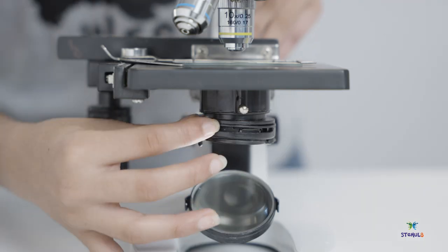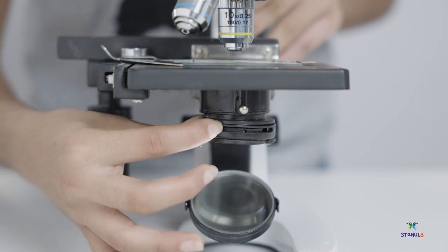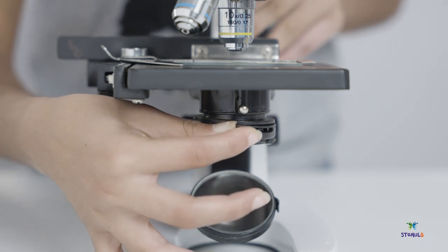Adjust the condenser for maximum amount of light. You can use the diaphragm to decrease the illumination.